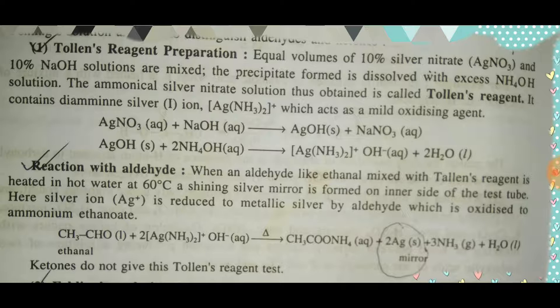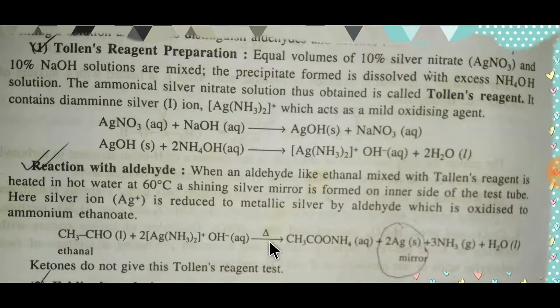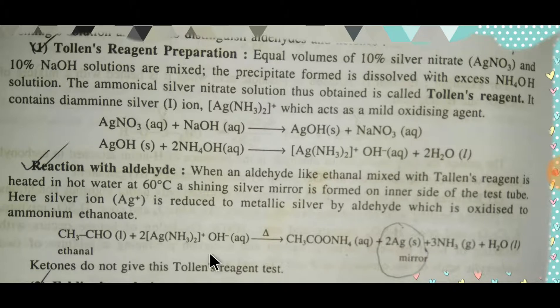Here we have ethanal. If you add Tollens' reagent — that is, diamine silver hydroxide — to ethanal and heat at 60 degrees Celsius, you will get a silver mirror formed on the inner side of the test tube.